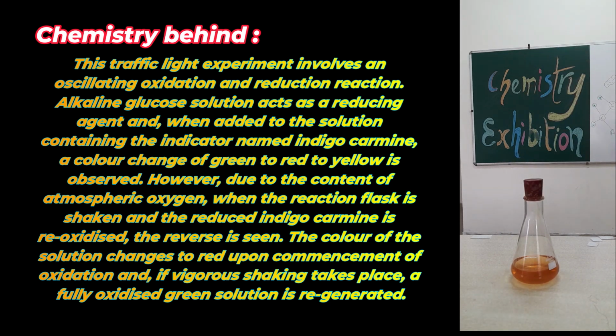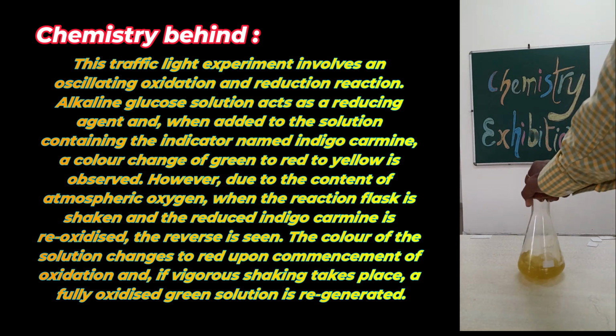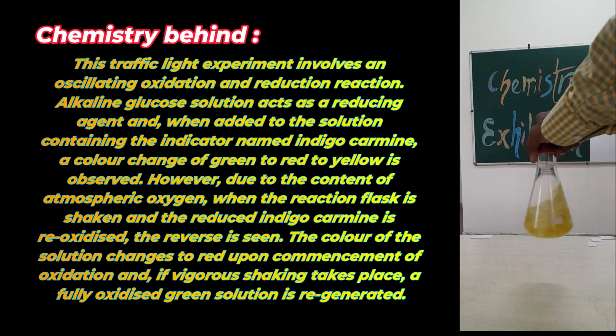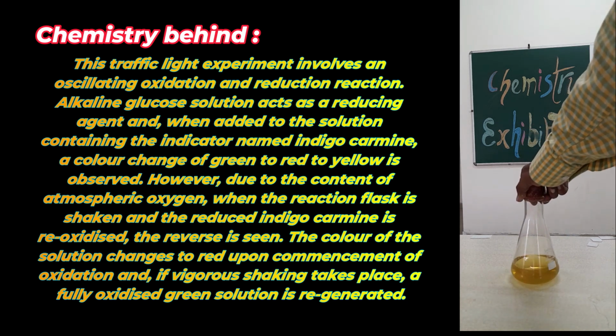However, due to the content of the atmospheric oxygen, when the reaction flask is shaken and reduced indigo carmine is reoxidized, the reverse is seen. The color of the solution changes to red upon the commencement of the oxidation, and if vigorous shaking takes place, the fully oxidized green solution is regenerated.